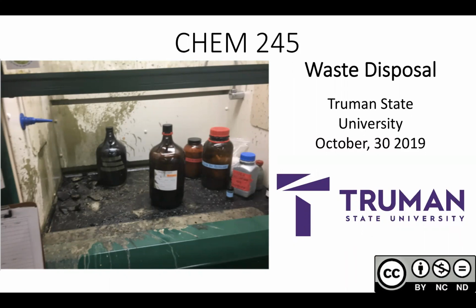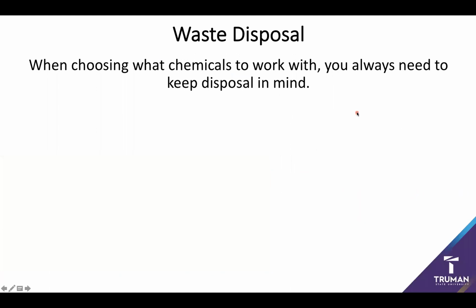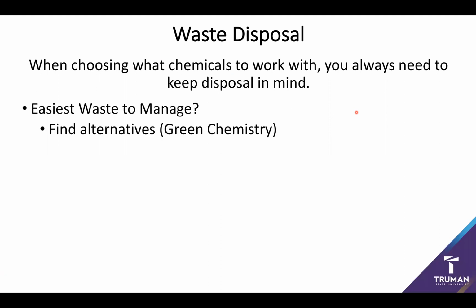So let's talk a little bit more about waste disposal. One of the things you should always keep in mind, no matter what step of a chemical procedure you're at, is what you are going to do with the waste. One of the biggest things you should ask is what's going to be the easiest way to manage this waste? And it turns out the easiest way is almost always finding an alternative.